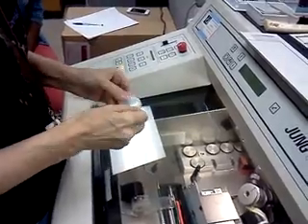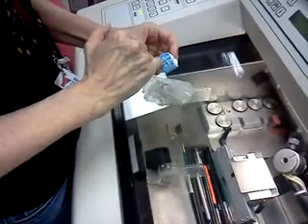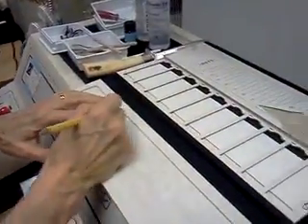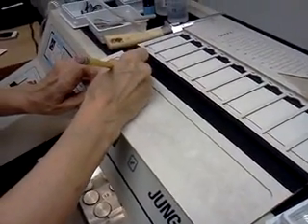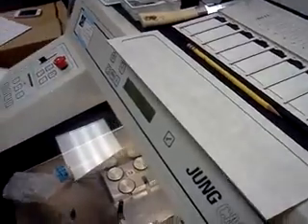You're ready to cut. So the next thing I'm going to do is get this in parafilm. Notice that the second wrapping has the label, and this is pretty ugly because this label is almost coming off, but we know that this is LV17 white adipose tissue. So what I should have put on here was the identifier for the animal, which was LV17. White adipose tissue. Okay?